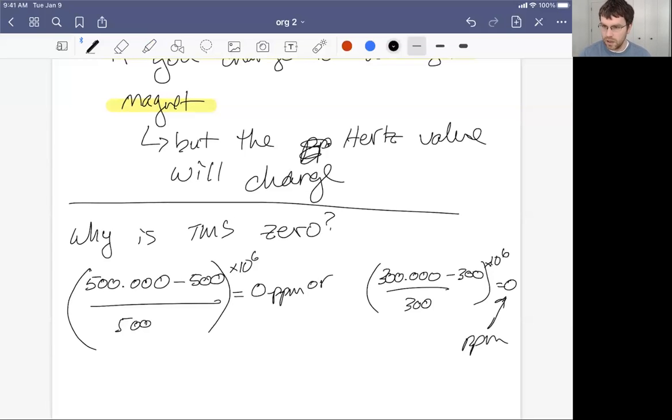So looking at this, with this knowledge, the anatomy of the NMR spectrum, we're ready to move into the attributes of the data that we will expect to acquire from an NMR spectrum.